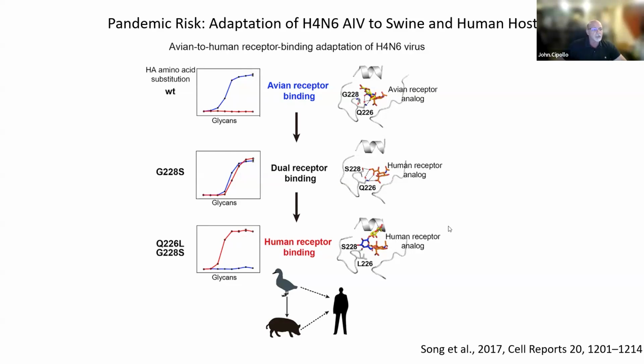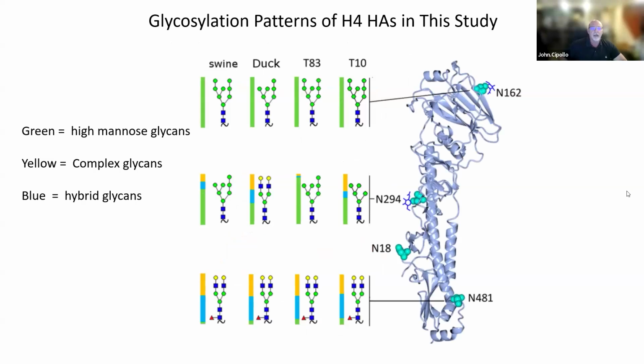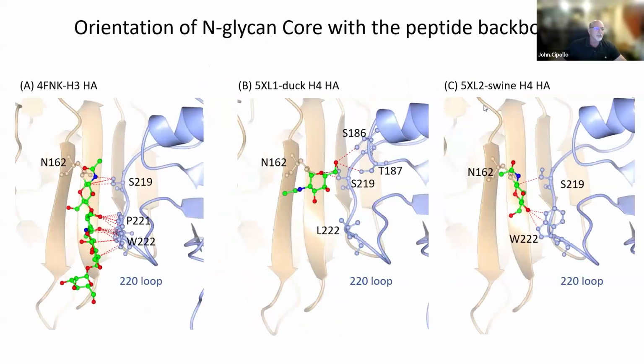What happens with SPD? All right, so I'm skipping a little bit closer to the punchline here. So this is the corollary to 165 in H3. This was really all high mannose. So at least these strains appear to present high mannose glycan.